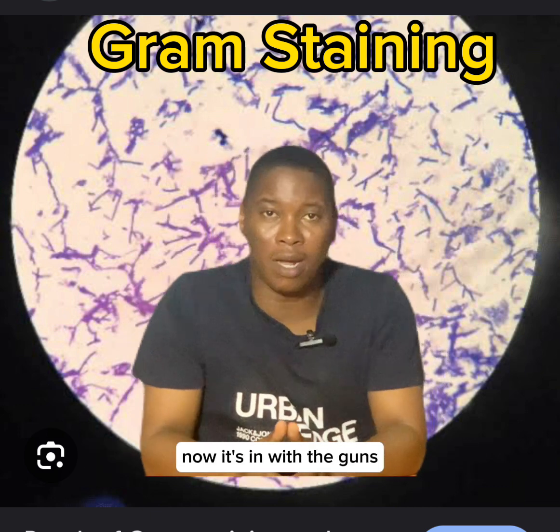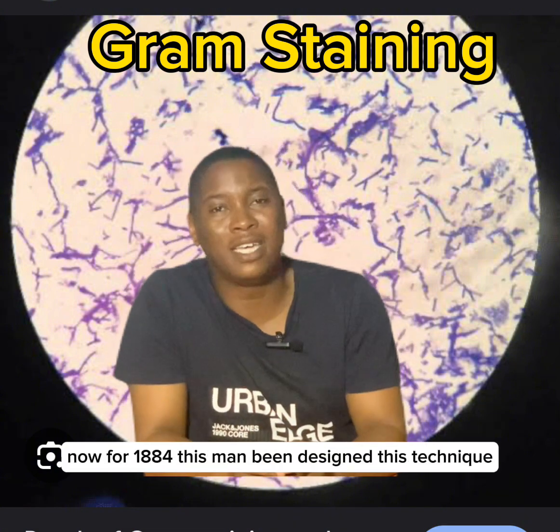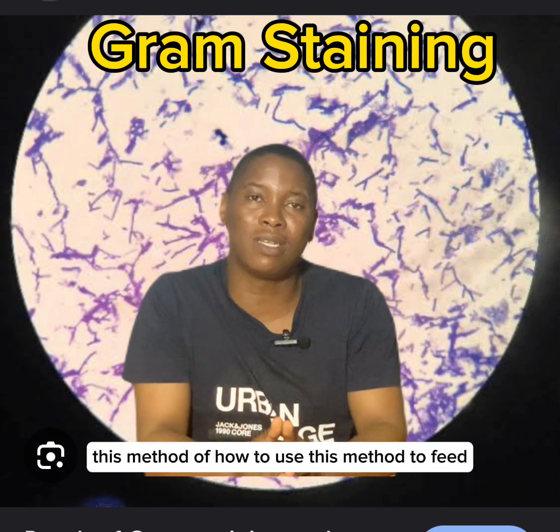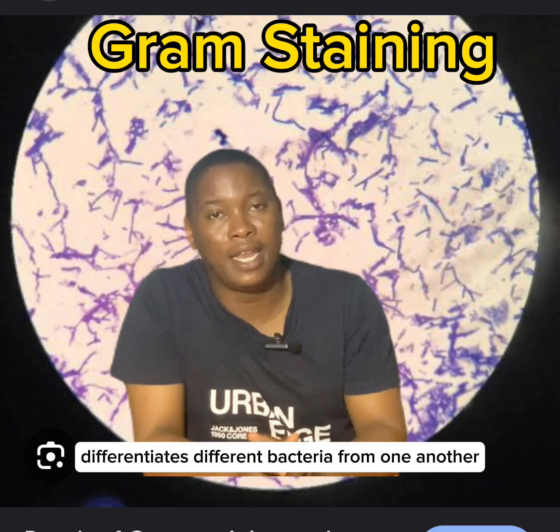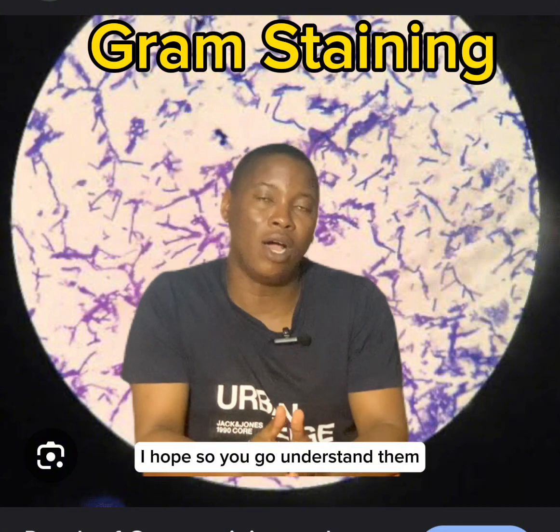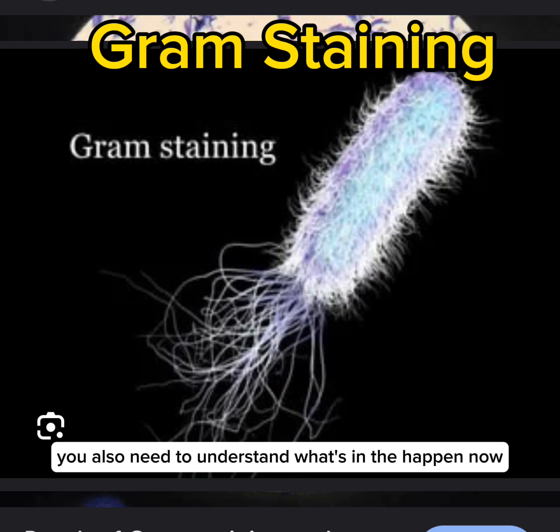Now, the thing with the gram staining na say e get one scientist wey we dey call Christian Gram. Na for 1884 this man bin design this technique. Him bin design this method of how we dey use this method to fit differentiate different bacteria from one another. Now, this method e get many steps, and we go discuss those steps very quickly. I hope say you go understand them. E no dey difficult. You no need to cram am. You just need to understand wetin dey happen.